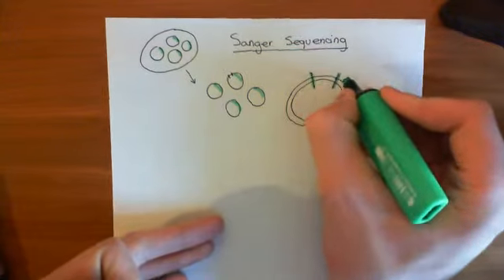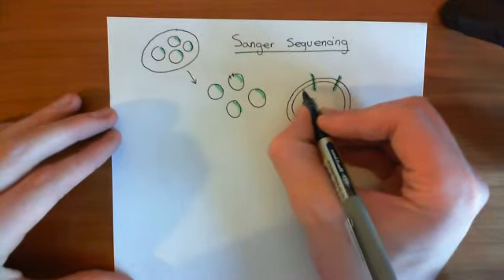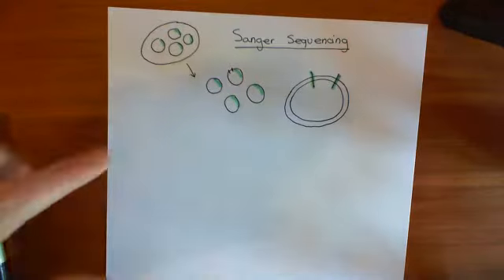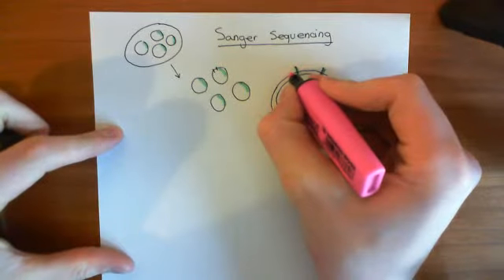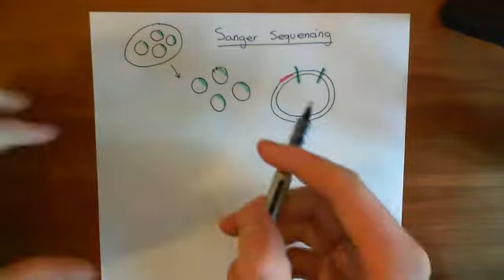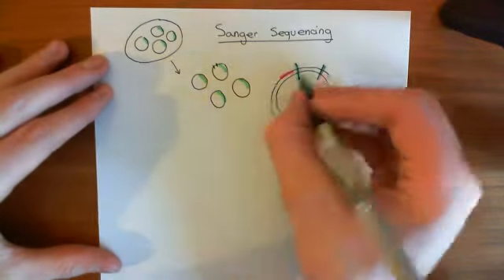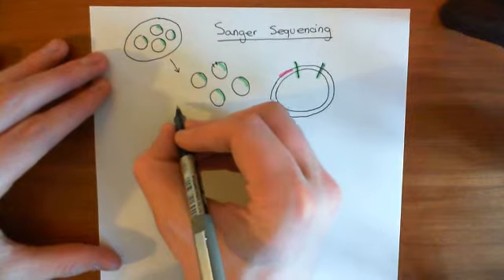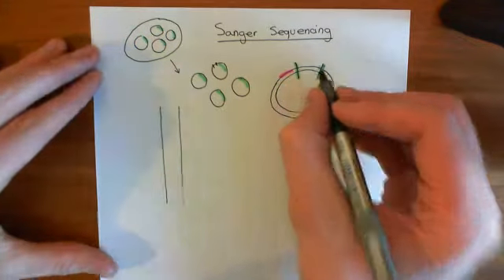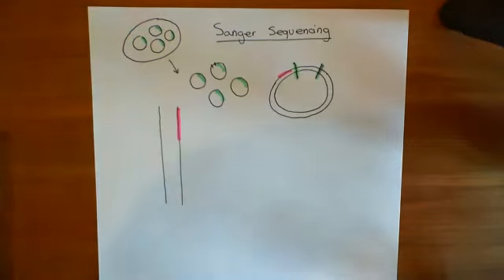Now basically, in front of the DNA fragment is a certain region which we will design a primer to, basically. So, let's say we take this region here. Whoops, let me just deal with this problem of me shaking the whole thing around. Okay, so we're going to take a certain region here and design a primer to it, basically. So now, let me draw this out linearly so that we can have a look, and let me give you some examples of organic bases that we could put in there. So let's just sort of bring this bit out and have a look at it in linear view. Okay, so I'm just bringing part of the plasmid out, and we're just looking at it, but I'm not actually taking it out as part of the experiment. It's still in the plasmid as far as the experiment's concerned. We're just bringing it out to have a look at it.